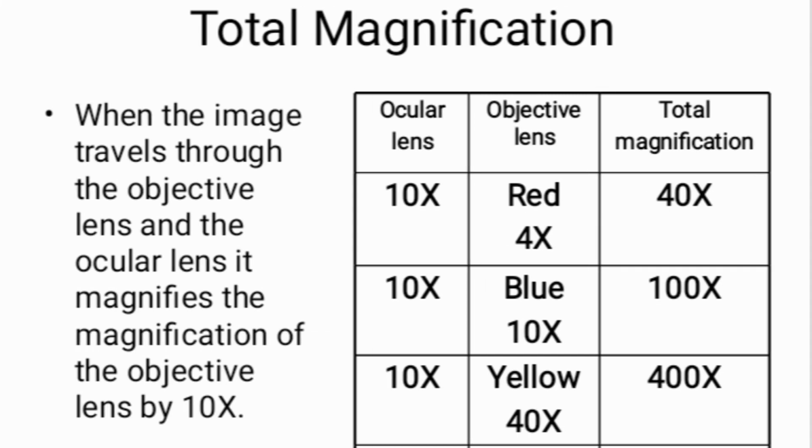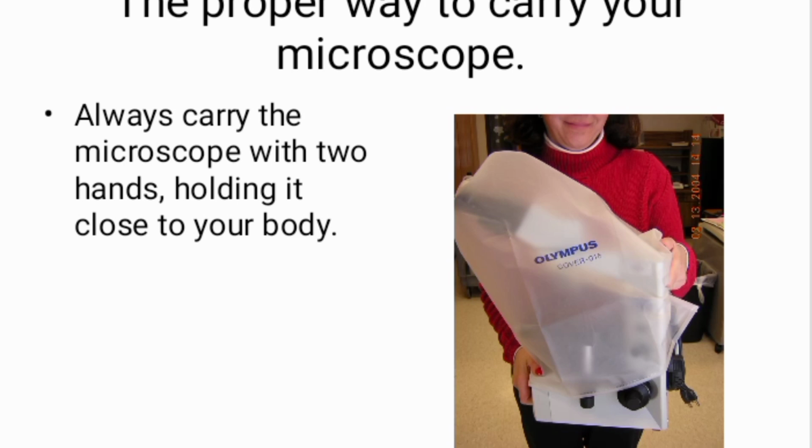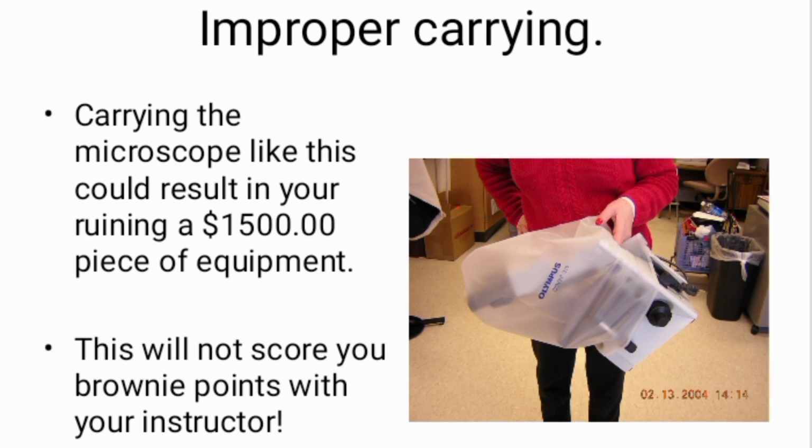All right, so let's move to the next slide. The proper way to carry your microscope. You can see the image on the slide. Always carry the microscope with 2 hands, holding it close to your body. Don't carry a microscope carelessly. It is an optical instrument and very fragile. Carrying a microscope carelessly could result in a serious issue, and this will not score you brownie points with your instructor. All right, next slide.